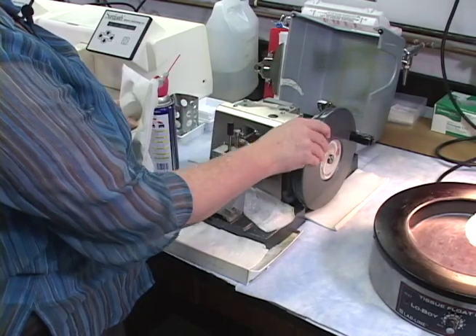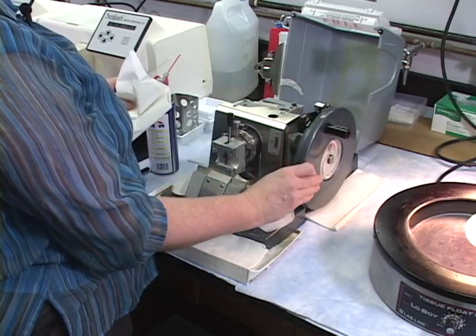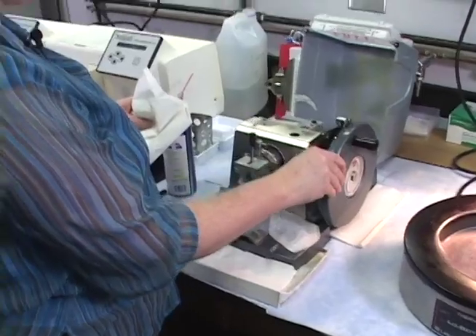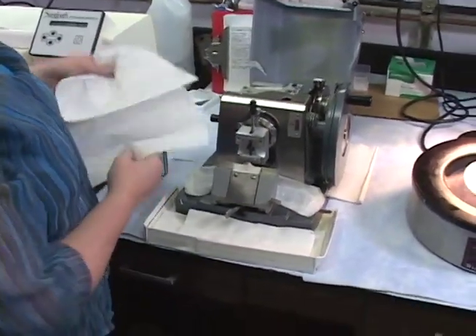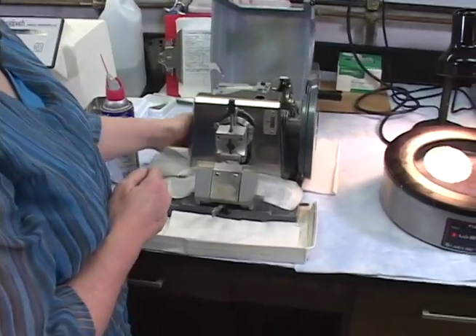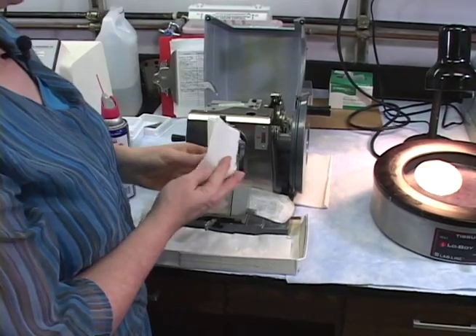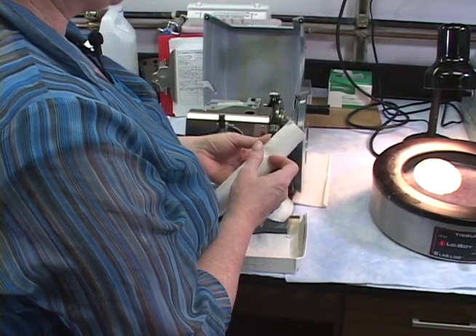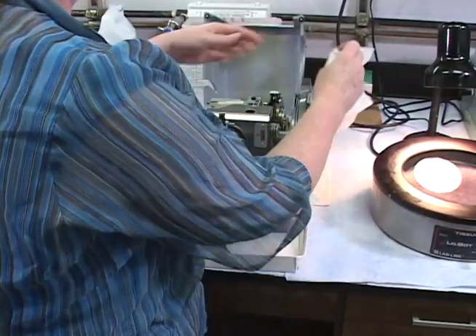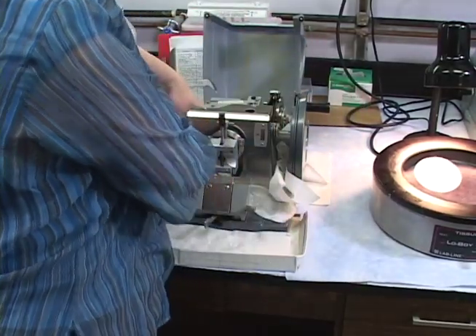I don't like to get oil all over the place, so I'm going to lock this flywheel. So it's locked in place right now. I also like to tuck in some paper towels around here because I don't want oil all over the bottom. Since I like to spray freely into these different holes, I don't want to mess everywhere. Maybe that's overkill, but then it doesn't get oil in places that you don't want it. I'll just tuck some paper down and around there.